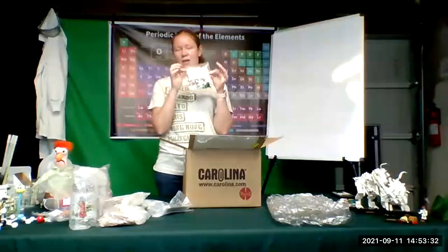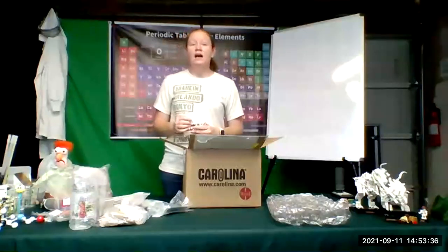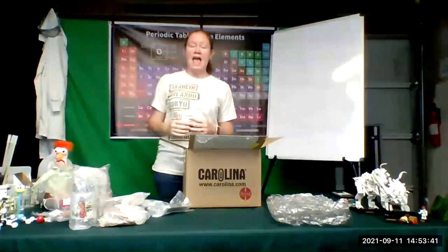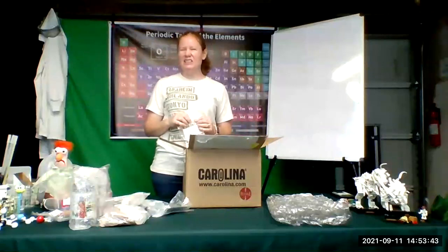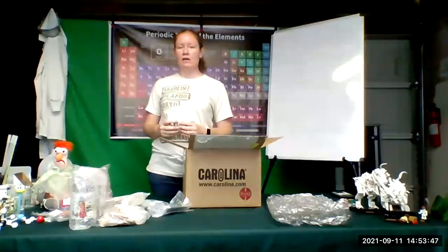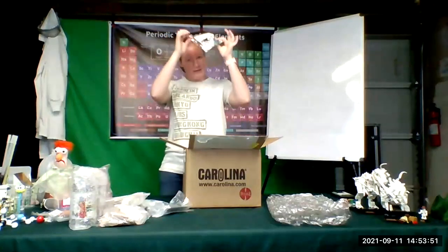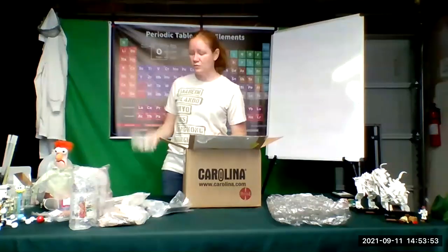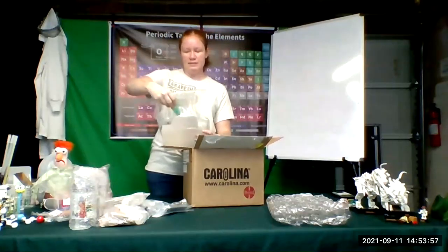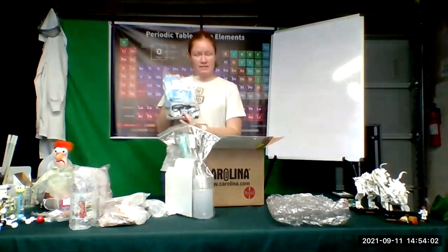And so that's where this is going to come in. The one that's written in your lab manual is much better tailored for this class. The experiment that's done by Carolina is meant for all levels, and it's actually kind of confusing the way they wrote it. So I don't want us to do the Carolina molecular model lab. We're going to do the Grossmont College molecular model lab, but we're going to use the model kit that comes with your kit. Okay, and then here I have my principles of chemistry equipment set and my chemistry safety set.